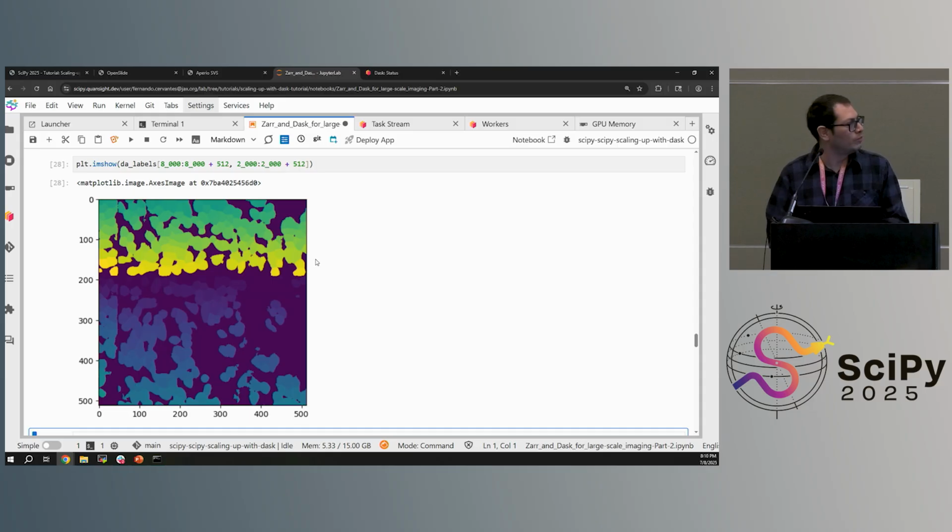So imshow. I'm going to use from scikit-image the color module, label2rgb, and I'm going to pass the labels that were generated as the inference evaluation of our model, and give it an alpha of 0.5, so we can see both images in the same display.